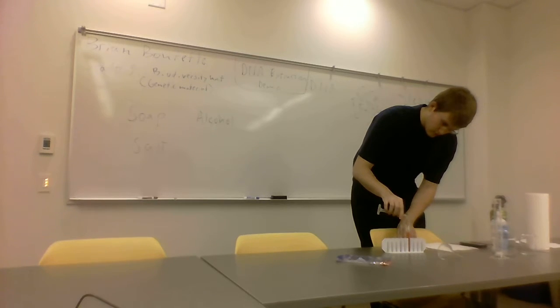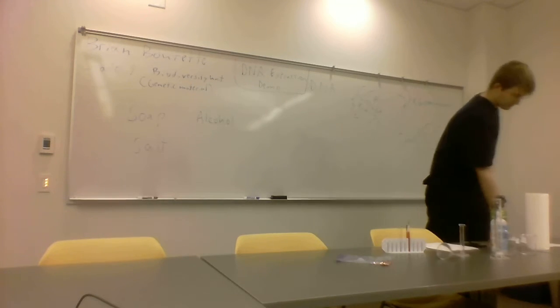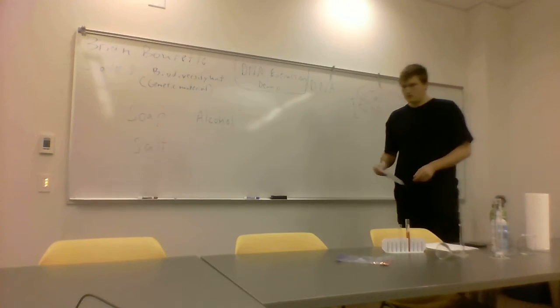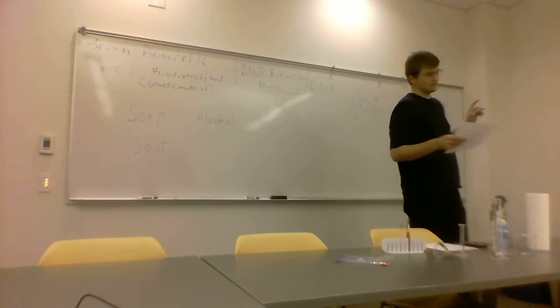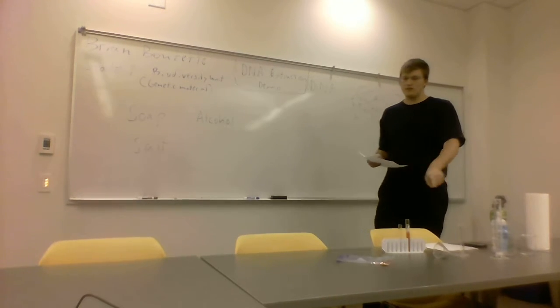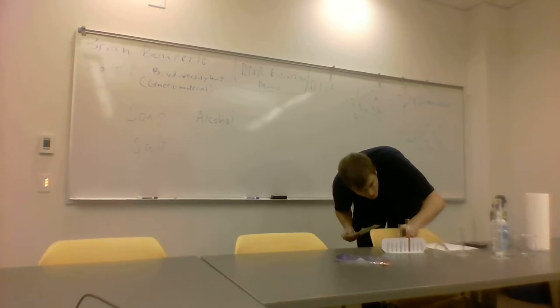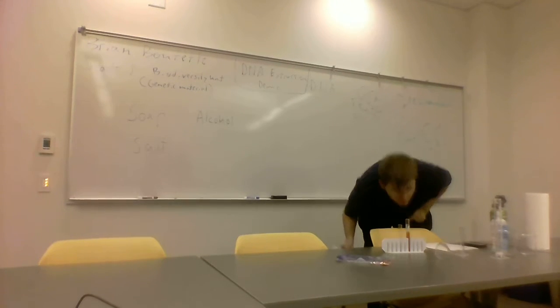Ooh, is there enough room? Yes, there is. Now, while we let that settle a bit, so what does DNA look like? Any ideas out there? Well, it's going to come up stringy and white. You guys will see it in a little bit. It'll eventually end up coagulating into the alcohol there. You can actually see a little bit of it already.